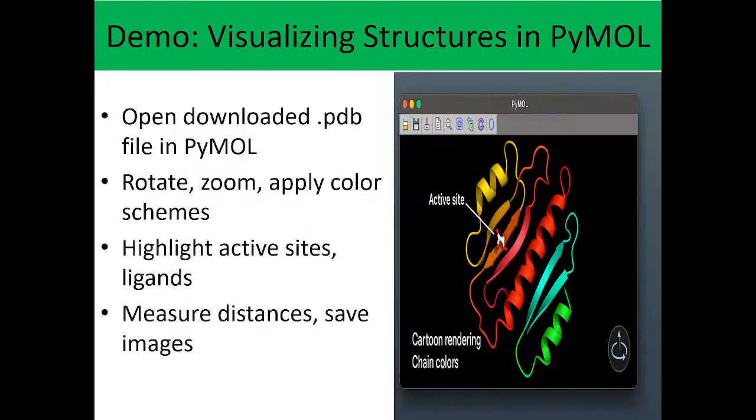Demo for visualizing structures in PyMOL. That is for us that are using a laptop or system. So you have to download the PDB file in PyMOL. The PDB that you downloaded the other time, it is now time for you to upload it there.